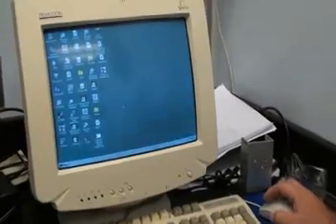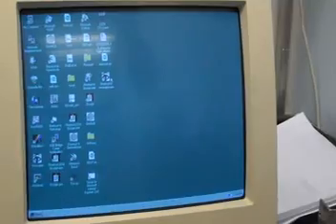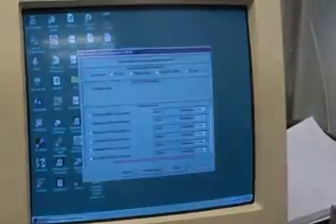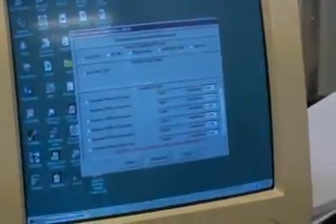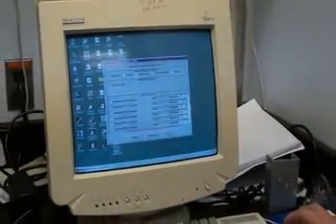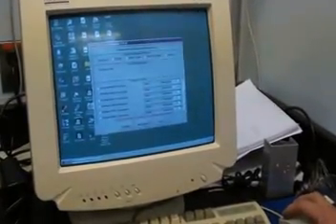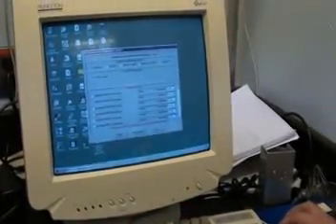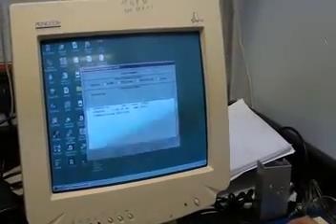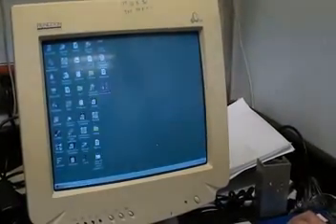Connecting to the PGT software — when you load it, you'll get an icon showing an eye for hardware super search. Click on it and it will give you various menus. Usually start with serial port, PGT ANS, Quantum. Pick a COM port compatible with your computer and go with the higher baud rate, starting at 115.2. Click Update and it shows communication is connected to your System 8000, gives the serial number on verification. Then just close it.